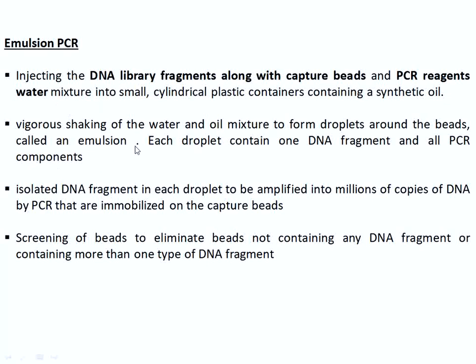So each emulsion contains one DNA fragment which is captured on the micro-sized bead, along with the water mixture of PCR components. After the formation of the emulsion, the isolated DNA fragment in each droplet will be amplified into millions of copies by the PCR reaction carried out in each droplet.